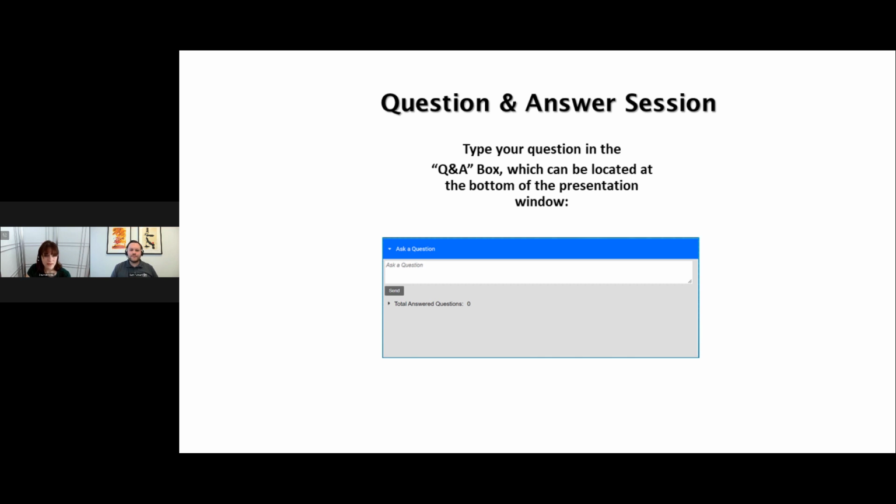Great, thank you. And how would you identify PFAS that do not have an available standard? Right, so this is one of the things that Metaboscape really lets us do. So the workflow for that would be to find the formula and name as well as the structure key for this. So even though we don't have an actual standard, we can put that structure into Metaboscape and then use some of the tools that we just saw like CCS Predict and MetFrag based on that structure to try and determine some matches, even though we don't have actual empirical data for them.